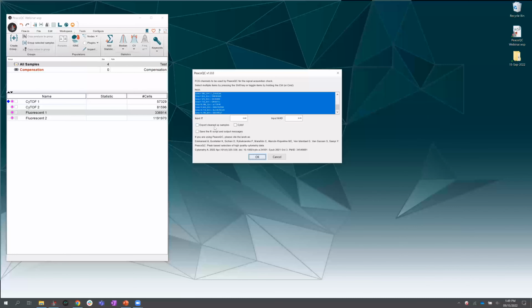The first couple times you run plugins, I always recommend saving that box there. And really that's because if you contact tech support with an issue for your plugin, if you provide them these files, it's incredibly helpful because that's where the error messages will be. So they'll likely ask you for it anyway. So you might as well just go ahead and have it at the beginning rather than have to rerun the tool just to give them that file.